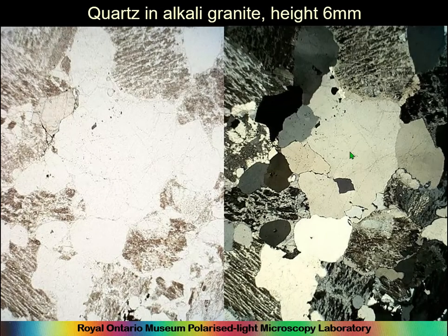So here's quartz with no cleavage, sitting here without any, and it's got something going on in here. See a bit better here, you can see. And so you look at these and think, is that a cleavage? And of course it isn't. One of the attributes of a cleavage is that they're all parallel. So maybe this might be considered to be parallel to here.